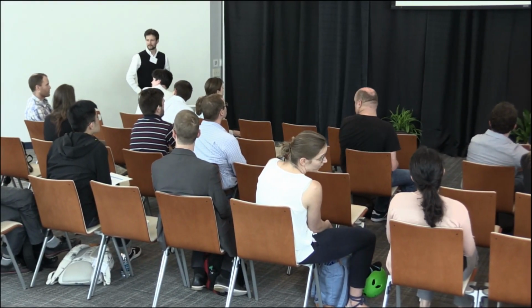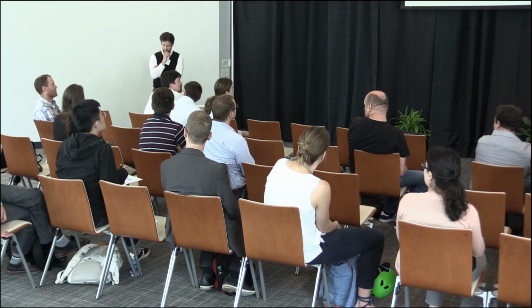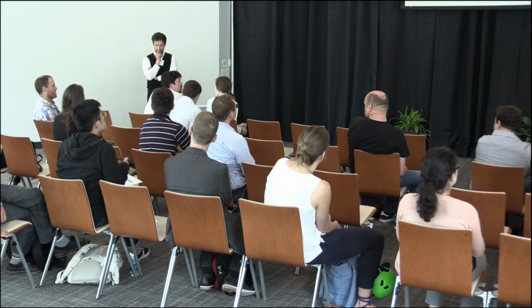Really simple question. Harrison, have you done experiments to prove that the freezing is necessary? So early on, it's a good question. Or tell me, how many experiments did you do to prove it? Yeah. So I haven't answered that completely, but I can tell you there was one early experiment where I forgot to do it. And it seemed to work just fine, but we haven't done it in a controlled way.